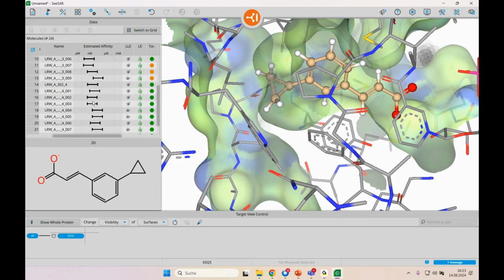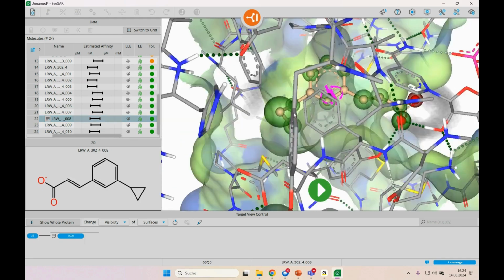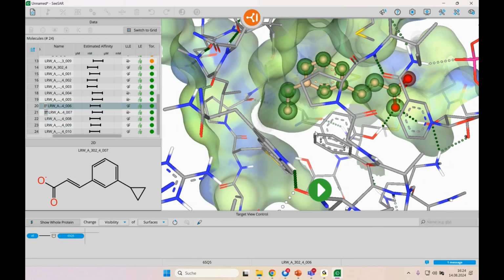And yeah, I'm actually surprised. So it works to some degree. At least nothing with absolutely horrendous clashes and whatnot. No, it's more or less fine.